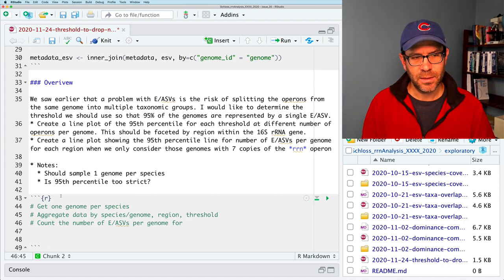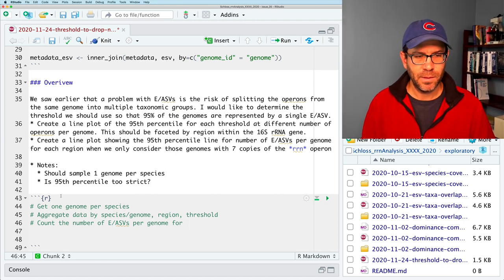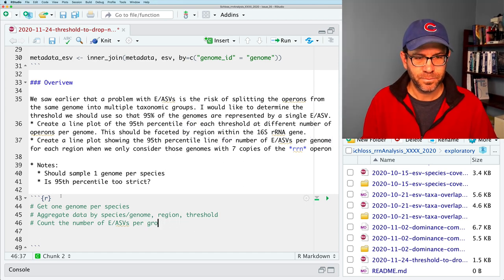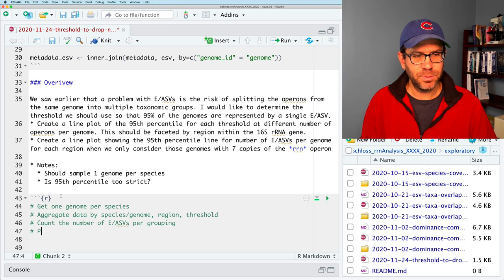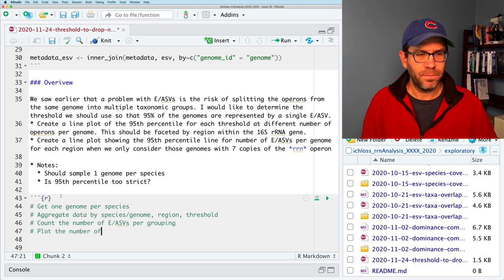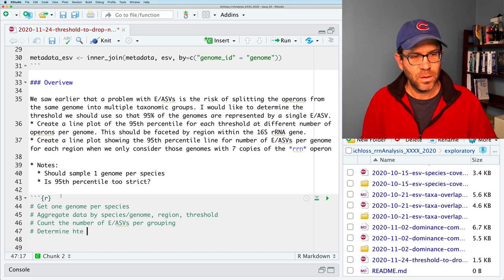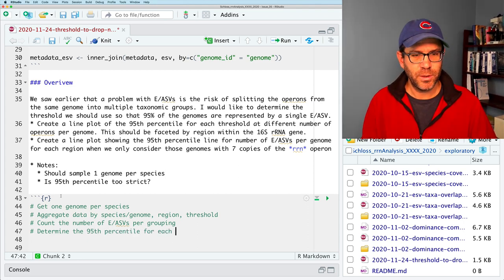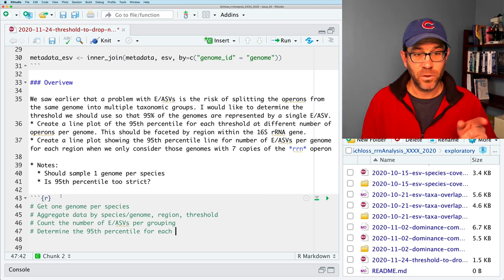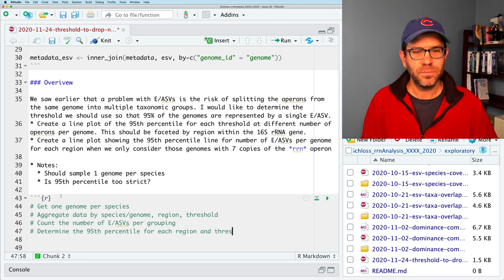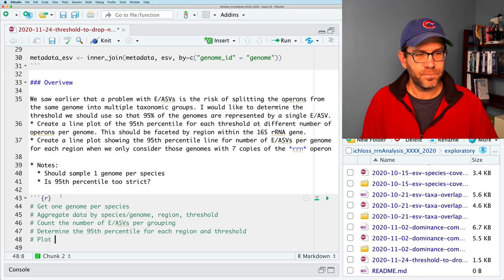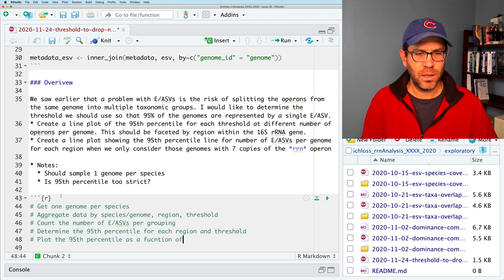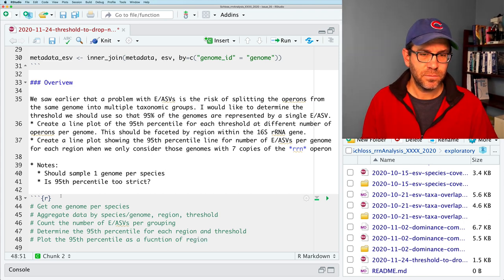We want to count the number of EASVs per grouping, and also count the number of rRNA operons per genome — because these genomes have anywhere between one and 25 operons. So we'll add: count the number of RN operons per genome, then determine the 95th percentile for each region, threshold, and number of RNs. Then plot the 95th percentile as a function of region and threshold.